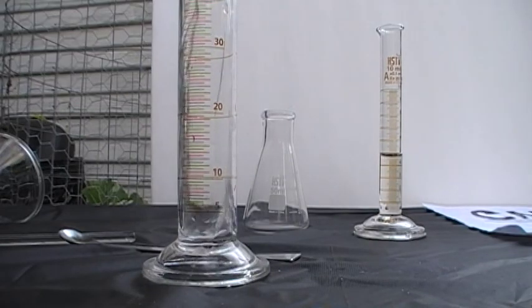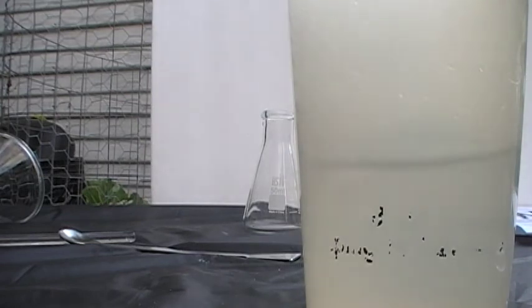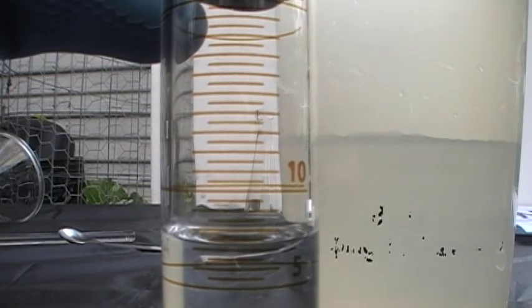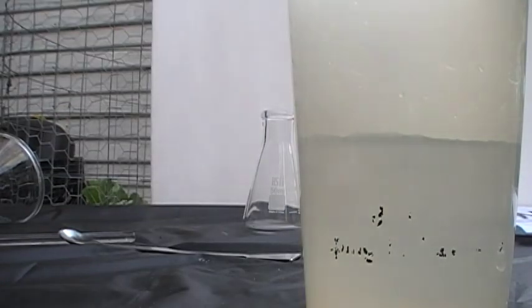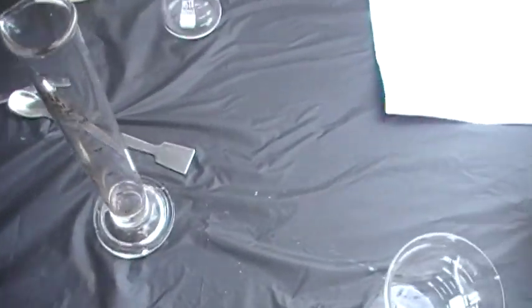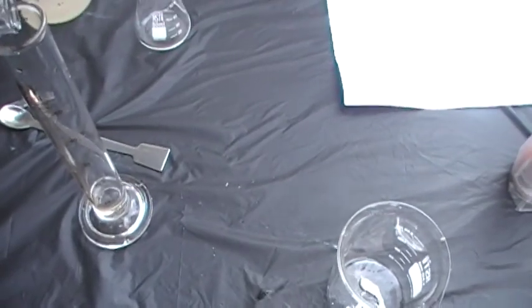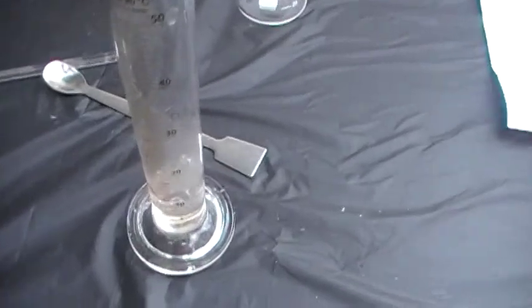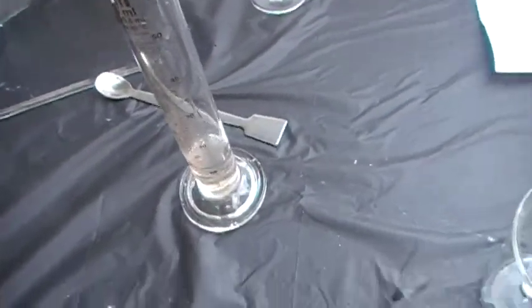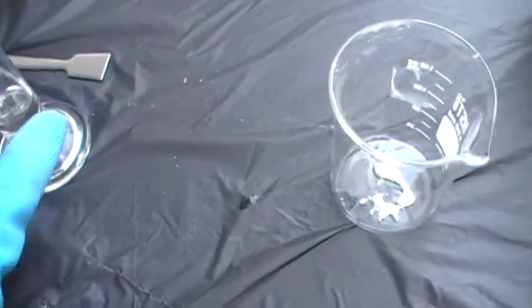You're going to measure out seven and a half milliliters of water. I managed to get that there — it's just a little bit over, sorry about that. You're always going to add your acid to your water. You can hear that — it got really hot. It's really hot, probably could melt my gloves. I'm going to do this very quickly because it burns.